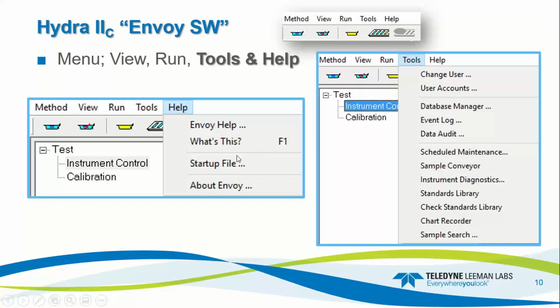Standard sample. Navigate the tool and systems. Kind of important. Most users put this right on, that guide this system through some day-to-day activity. You can do ramp temperature, so ramp up to combustion temperature, on dryer temperature, with just a splash screen.